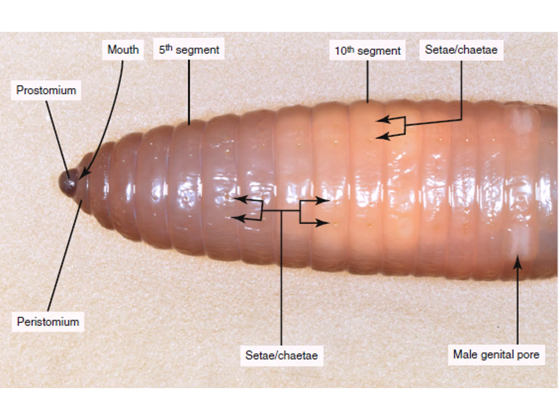Side up, we can see that the ventral side is a little lighter than the dorsal surface. If we run fingers on the ventral side of the body, especially on the lateral sides, we can feel bristle-like projections. These projections are called setae, and these setae help prevent slipping of the earthworm and help in anchoring of the earthworm while crawling.